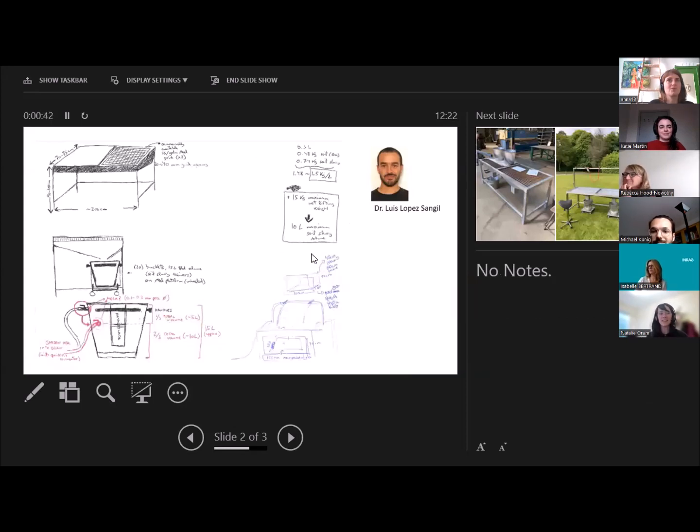So it sounds kind of simple, but getting the roots out of the ground can be quite a hassle. For instance, when I arrived at Innsbruck, we were doing it kind of over buckets. This doesn't work so well because you have to be comfortable for many hours when you're washing the roots. So we built one in Innsbruck that was just kind of a MacGyvered one, but in Chagos we got a chance to build a really nice one.